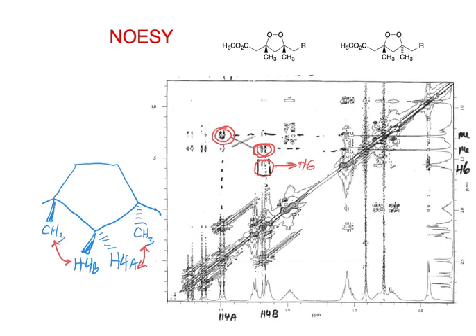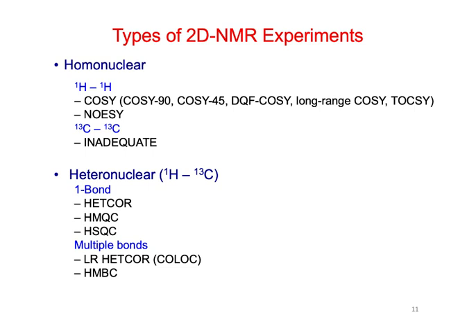So yeah, it can be useful for stereochemistry. It could be useful sometimes in peptides, going from an NH. Let's look back. At Utah, there was a new faculty member looking at the three-dimensional structure of DNA, and he was using NOEs like this. It's in a helix, so there's a certain distance where you can see NOEs from one turn of the helix to the next one.